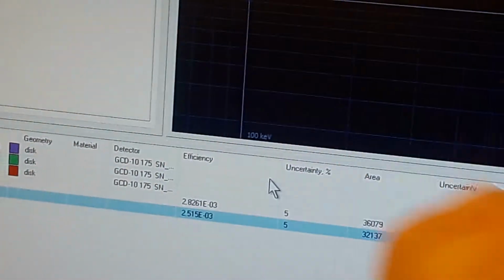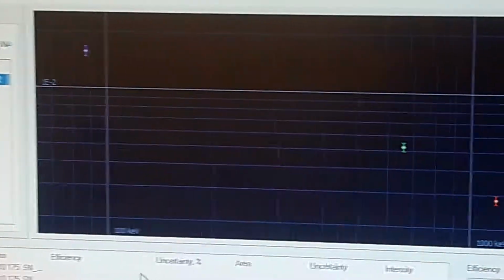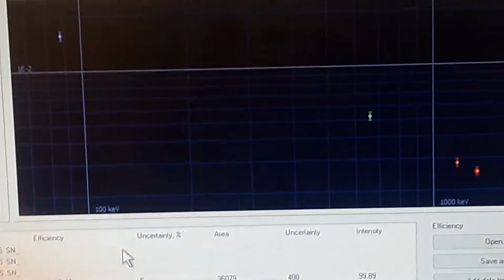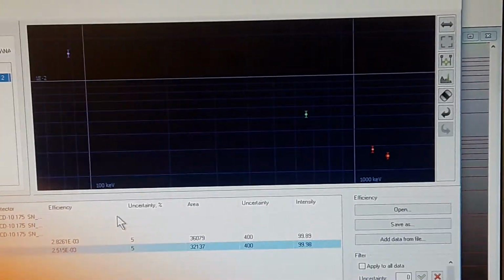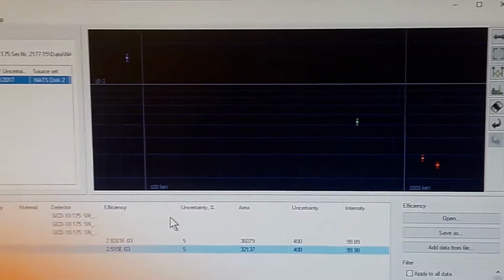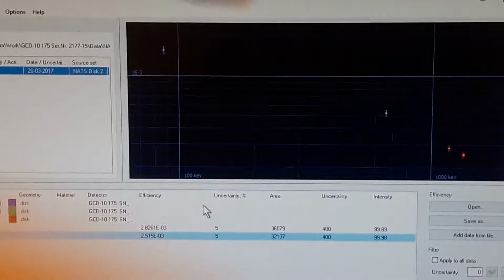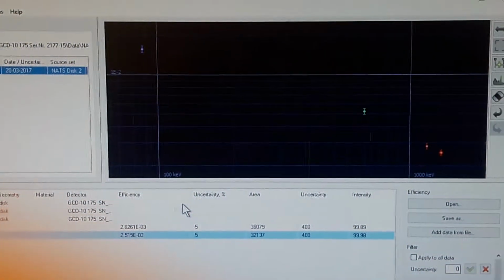And then it will create some data points in here for the 4 data points that I have used. Now I have to do a fit and see if it looks like the characteristic profile of a p-type detector, where you have the highest efficiency at around 40 keV, and then it starts to drop off as you go up in energy.